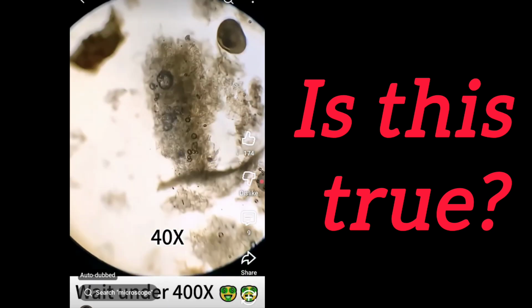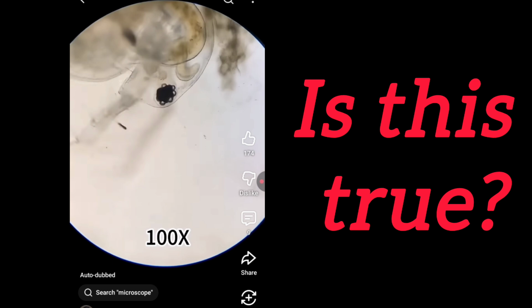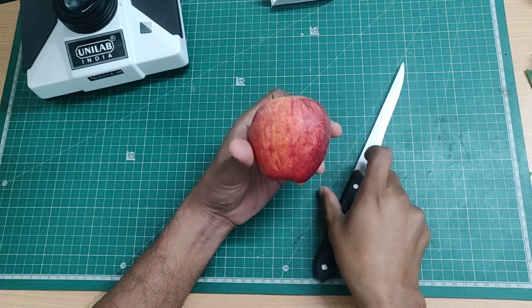This video has gone viral and many people believe apples contain microbes trapped in the wax. But is that actually true? Let's test this properly.